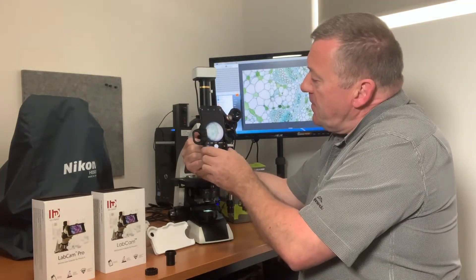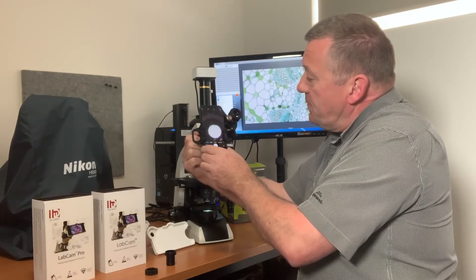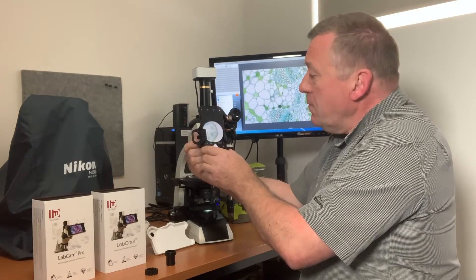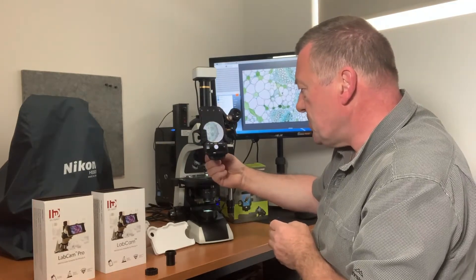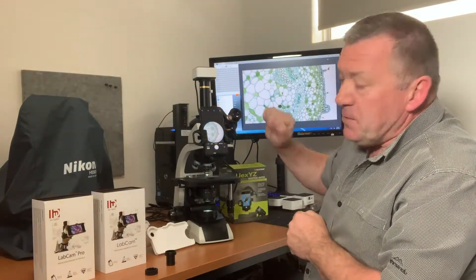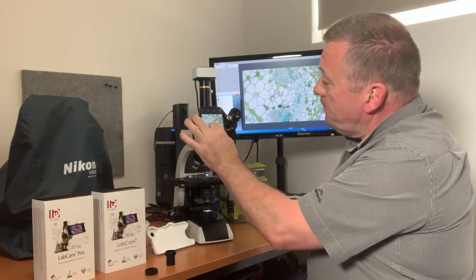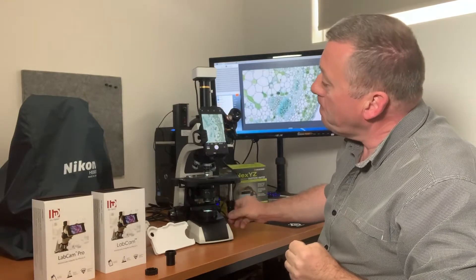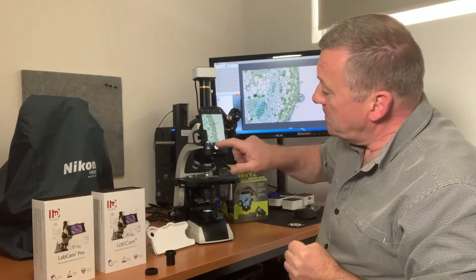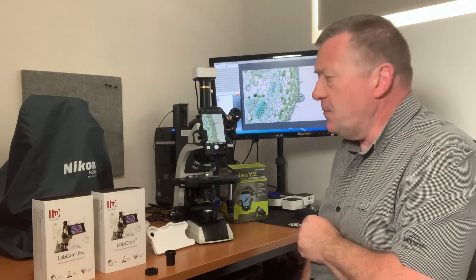There's a fourth adjustment that controls the camera distance from the eyepiece to your iPhone camera. With all those adjustments you find a little sweet spot, and then you can zoom in and take your photographs. You adjust your microscope to adjust your field of view, and taking a picture stores it to your camera's picture gallery.